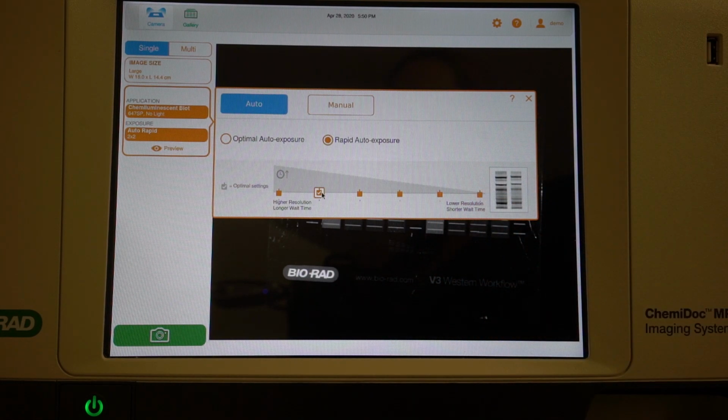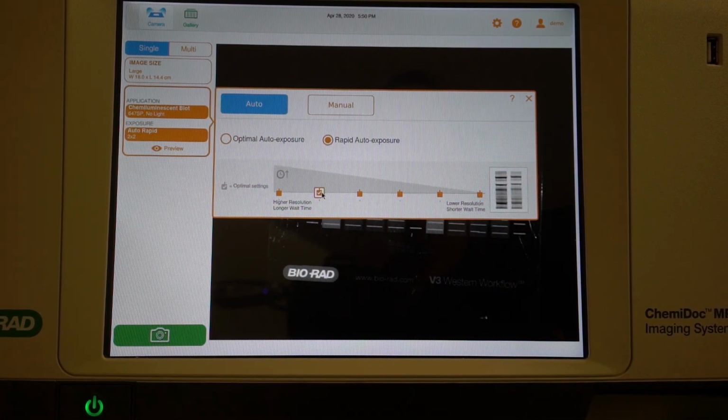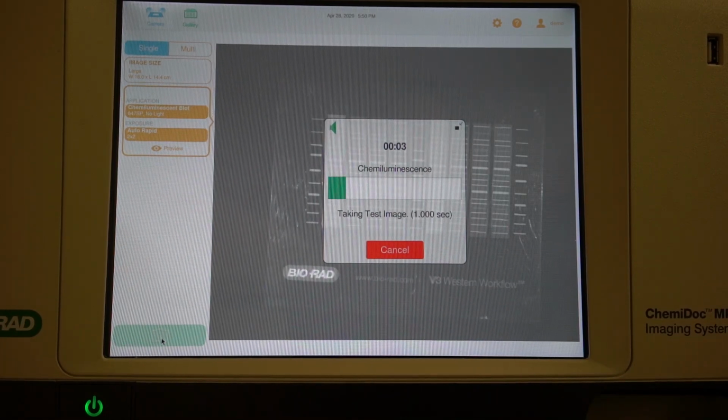So usually when I'm taking a first image, I like to just do the rapid auto exposure just to give the imager a chance to take a picture, and then I can determine from there whether I want to increase the exposure time or adjust any other settings. So then once you're ready to take a picture, all you would do is hit the green camera at the bottom.